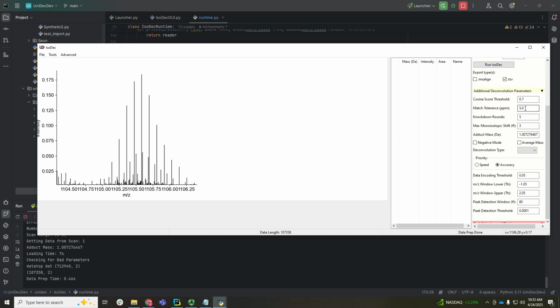So this can be relatively low because it's essentially a relative spacing thing, not an absolute tolerance issue. So basically, if this were like a plus 10, we would expect the spacing between each isotope peak to be 0.1 m/z. And this 5 ppm tolerance corresponds to how much wiggle room there is around that particular m/z spacing.